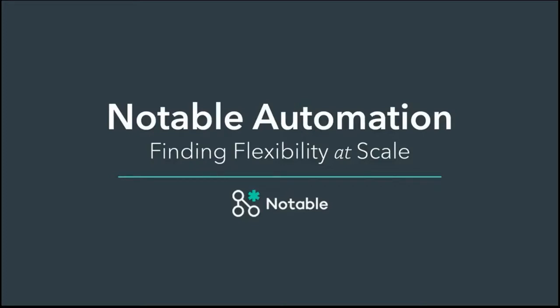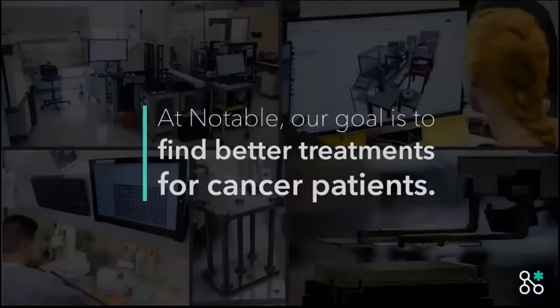So in this talk, we're going to cover how we develop automated systems in our lab with flexibility in mind, so that our scientists can change their workflows while still taking advantage of the automated tools available to them. But before we get into that, I want to give a little background about us.